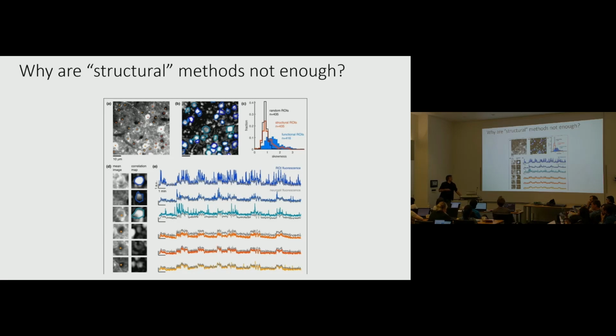We were getting that, and so we decided we're just going to set it to some average value for all the ROIs. And perhaps the thing that we do to validate this is we change this value. The default is 0.7. That's just some number that I think the original GCaMP paper used, and then everyone after that started using. So we just use 0.7. What we'd recommend is you try to change this coefficient and see if it influences your results. If it does, then you're in trouble, and you have to think a lot harder about this. But if it doesn't, then it probably doesn't matter that much. It didn't depend so much on the exact coefficient.